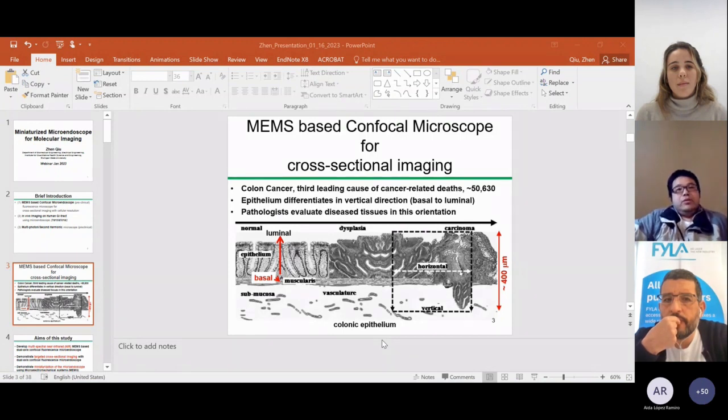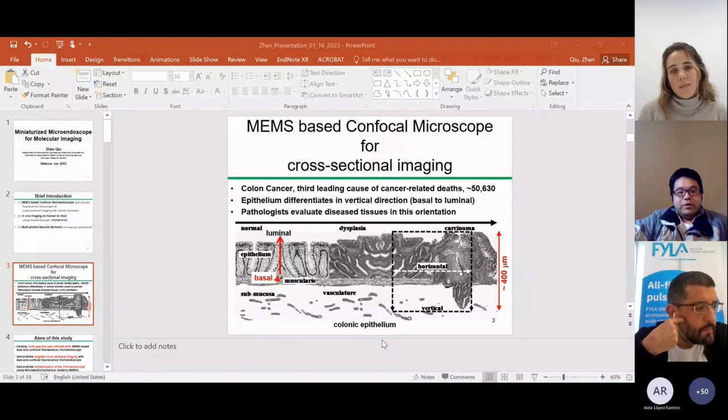So we cover both confocal fluorescence and also multiphoton. You're mentioning the confocal or multiphoton? Actually, both of them, if you can give a general answer. For the first one, the signal to noise ratio is quite high because we are taking advantage of molecular imaging using a peptide conjugated with a near-infrared dye.